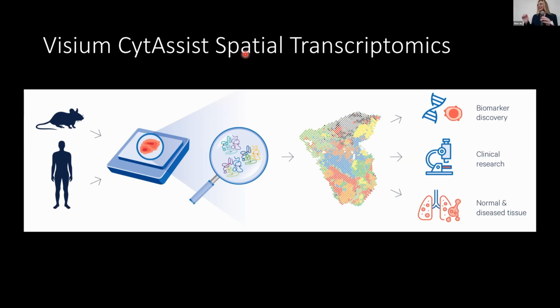And so this is where I start hitting into lab meeting, because remember, I only have one set of data to show you, but I wanted to do the setup. We decided to use the Visium spatial transcriptomic technology because we were willing to sacrifice single cell resolution at this point in order to do as best as possible whole transcriptome discovery, because very little is known about any of the RNAs that are expressed in this window of time, because these samples are extremely difficult to get.